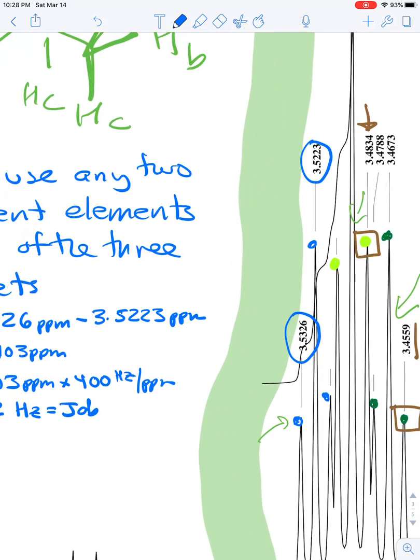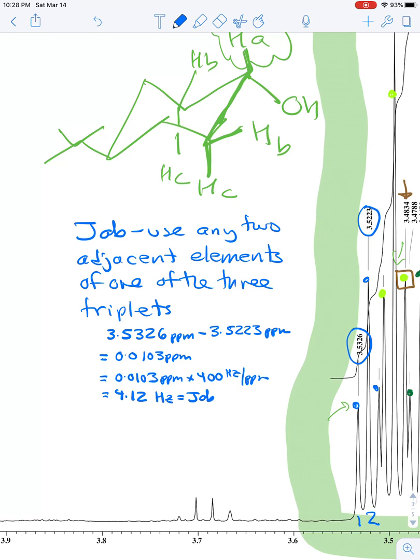So again, you subtract the two numbers, that's the part per million value, and then you multiply that by 400 hertz per part per million, and that gives you a value of 4.12 hertz for JAB. And again, that's within the normal range.